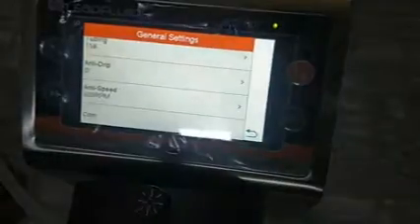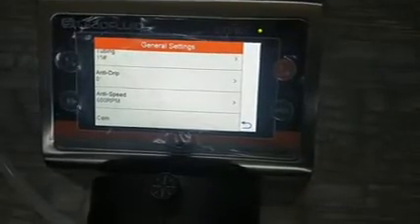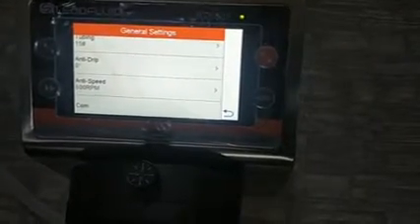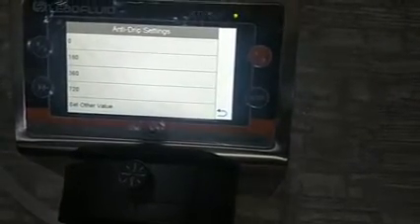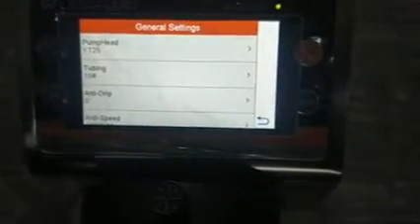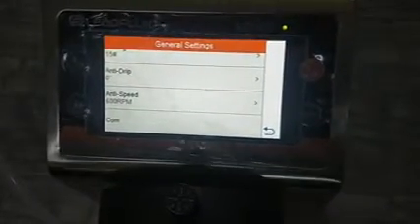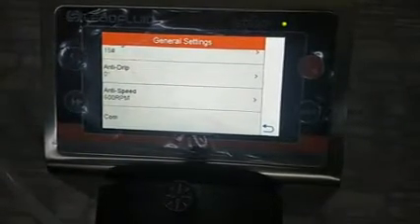Anti-drip is an important function. At the end of a run, if you want to ensure no extra drops come out, you can give some reverse angle — say 360 degrees — so after finishing the run it will reverse to prevent extra solvent from coming out. At this moment I am keeping it zero. The anti-drip speed should normally be kept at maximum RPM, which is 600 RPM for this pump.